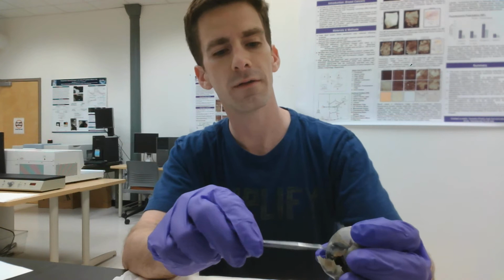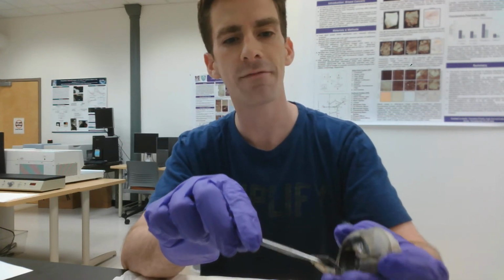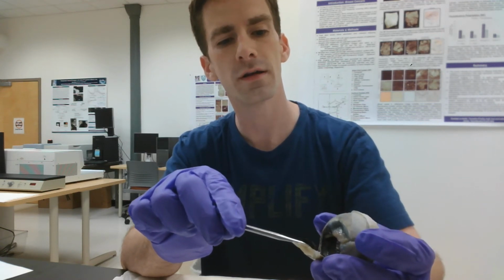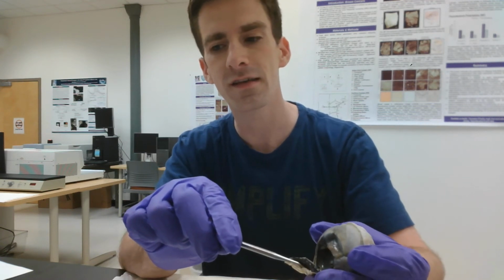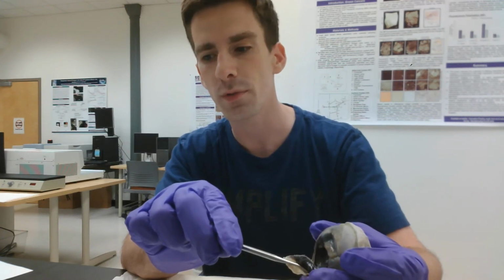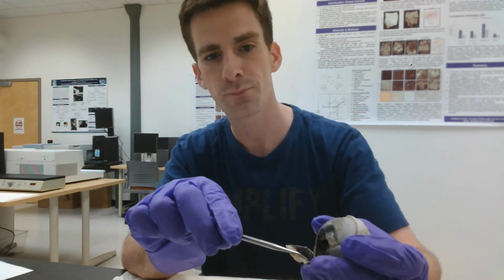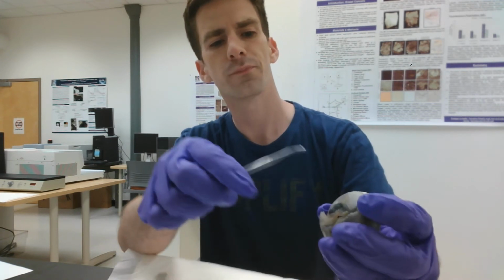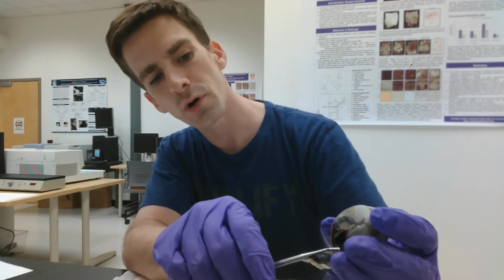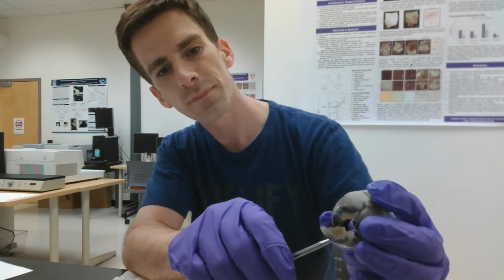So if you look at this here, there's a cavity between the cornea and the iris, and that is the anterior cavity, and it contains the aqueous humor, which is a thin, clear, watery fluid. Now, if we look through here, through the pupil, here you can see the lens of the eye.